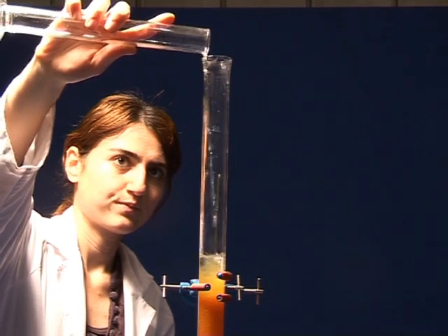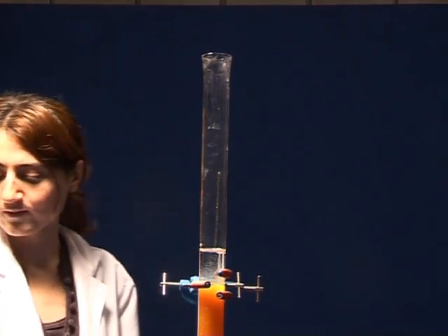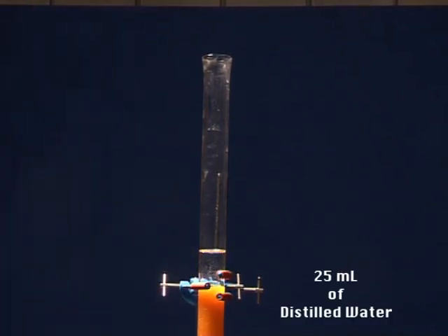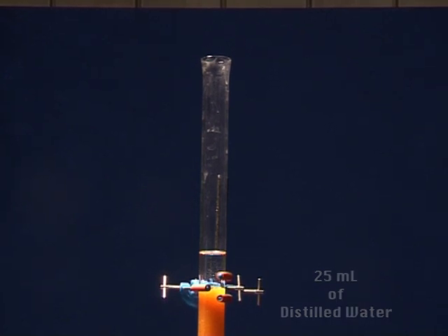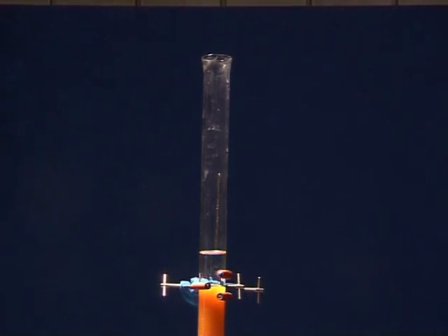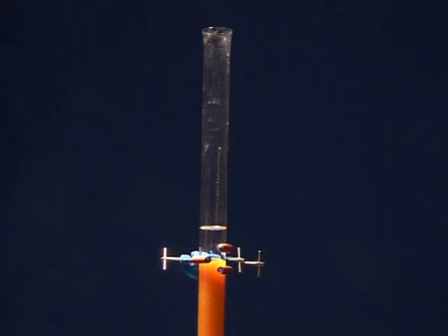When nearly all of the distilled water has flown into the column, add another 25 milliliters of distilled water to the column. This should wash the remaining tap water into the Erlenmeyer.